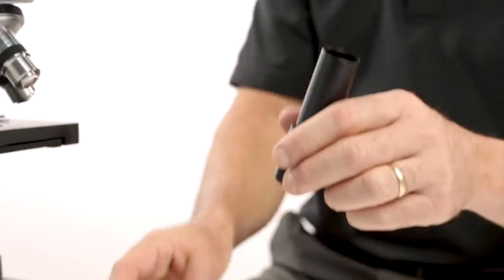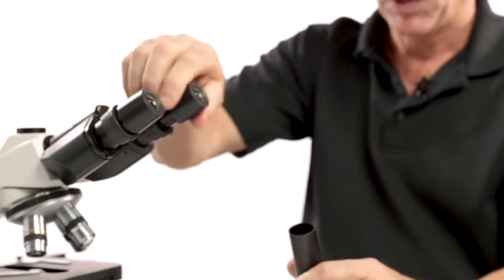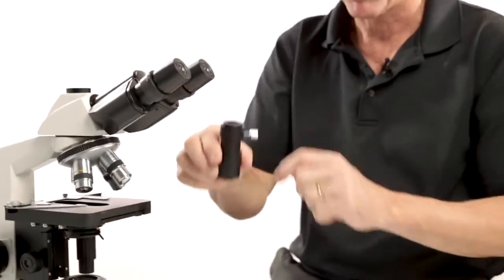We also have an eye tube top, which accommodates an eyepiece. The most common and best way to mount a camera to a microscope is with your C-mount threading.